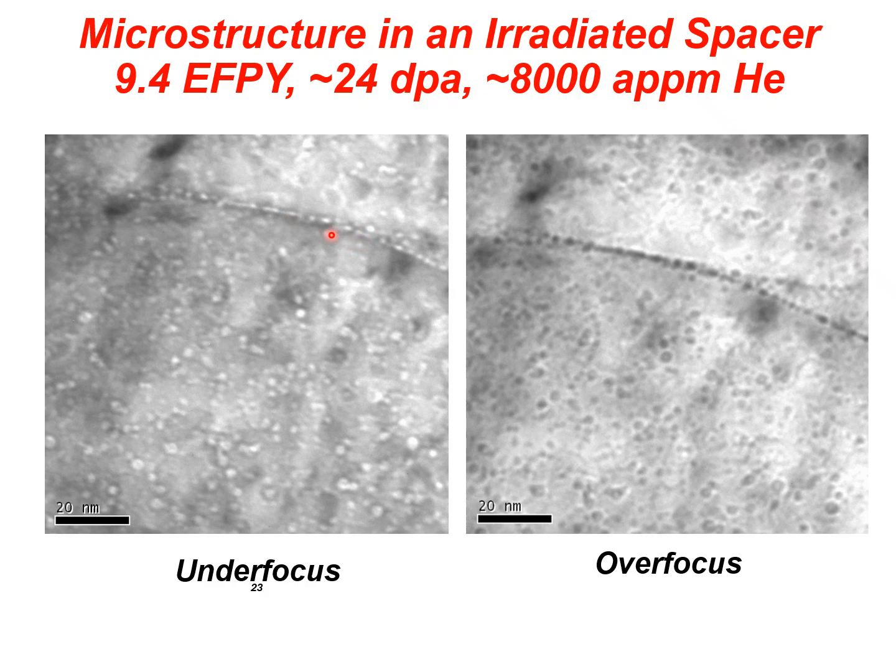to know that these are cavities. Because if you have deposits, surface deposits, especially amorphous oxide surface deposits, it'll show the same contrast. So you have to be careful. You have to basically take stereo images, and I did in this particular case, because it was important to me to know that these were real and they were in the bulk of the material. So I took stereo images in this particular case, and I satisfied myself that these cavities were in the foil. They were in the bulk of the material, as well as these being on the boundary.